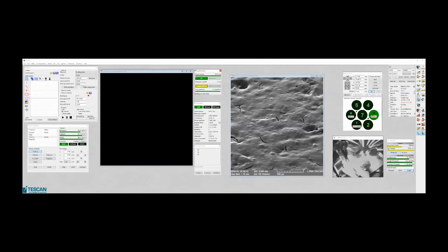While the electron beam emission is still on, for the focus ion beam, emission has to be turned on for each session because of gallium consumption, as it's a liquid metal ion source. So it's heated each time. So we need to turn emission on. It's taking a long time. I hope it will work.